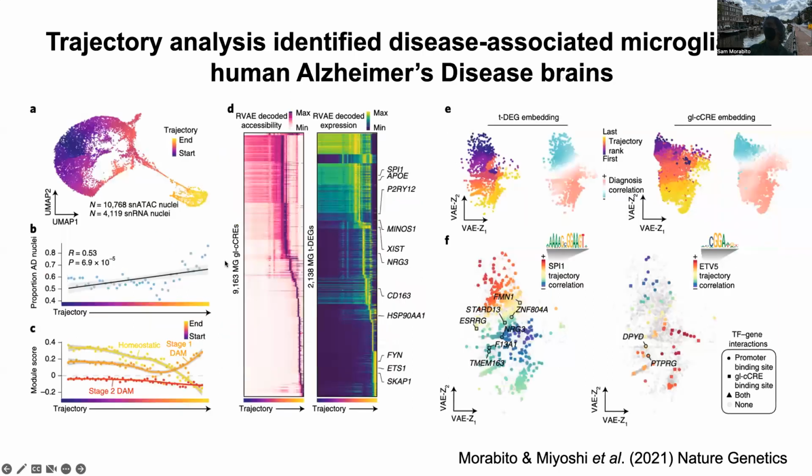And then in my own research, we wanted to do something similar, but we looked at it with human data, and we had ATAC-seq and RNA-seq data together. I think we used Monocle 3 for this, but they didn't explicitly tell you that you could do this on integrated multi-omic data. We just thought, we should try and see what happens.